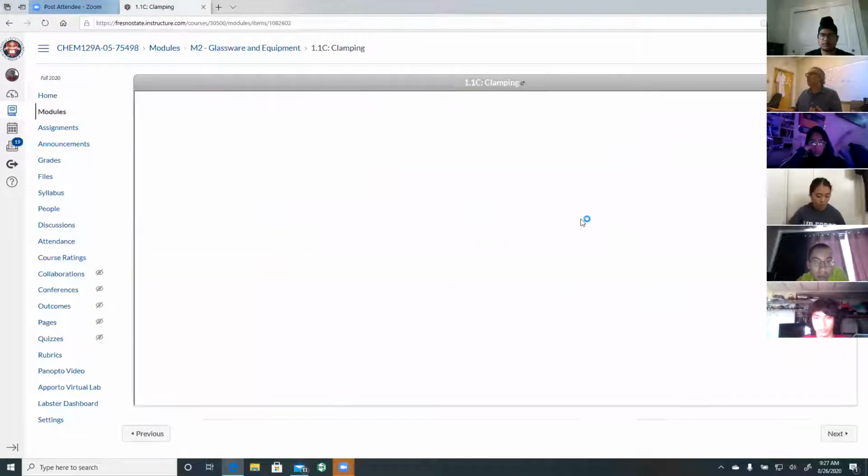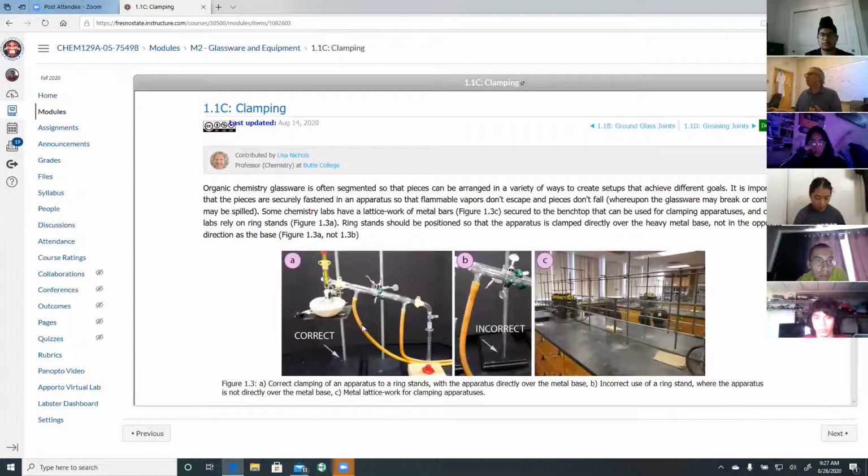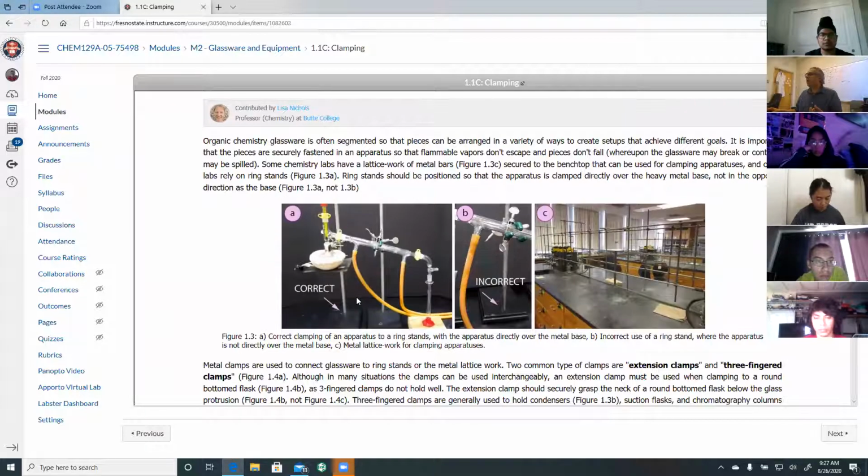Next one is a distillation setup. Picture A, round bottom flask. It's what you just saw there. This is the complete thing. And you use clamps to connect your glassware with the monkey bar. You see these little aluminum or cast iron bars in the back?